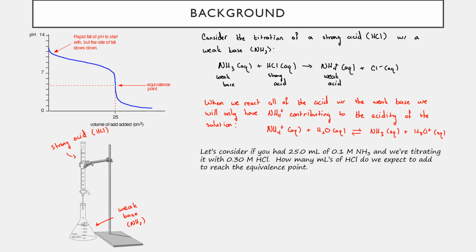You've done some of the titrations in the past in the lab. It's often good to do a rough calculation in the beginning just to see what you expect to be that equivalence point, because it sneaks up on you. You see how fast or large the slope is at those equivalence points, and so just a drop can change the pH drastically in those regions. And so if we have an estimation of where that window is, we'll do a better job of sneaking up on that equivalence point and getting an accurate titration.